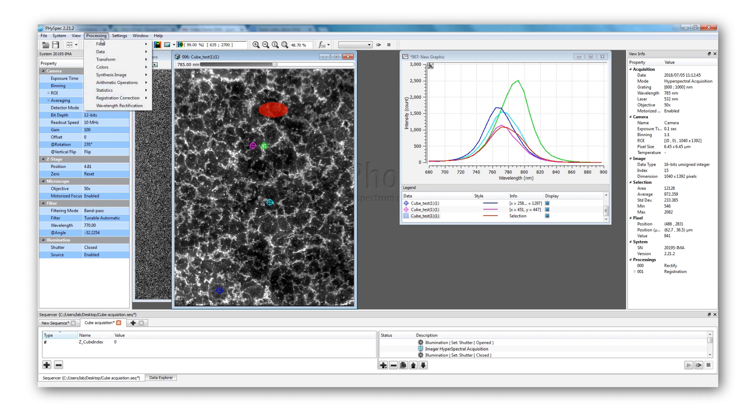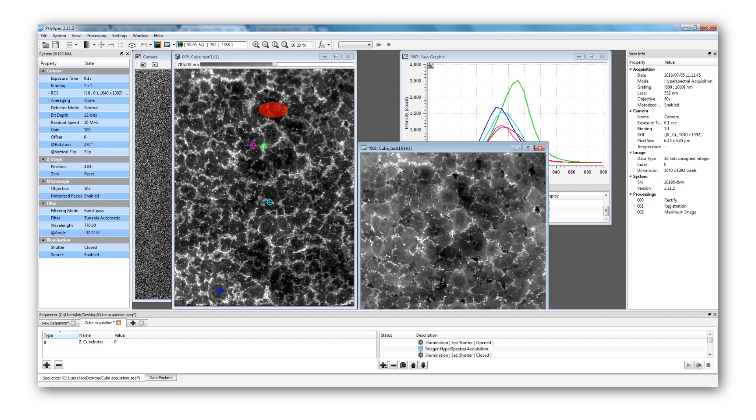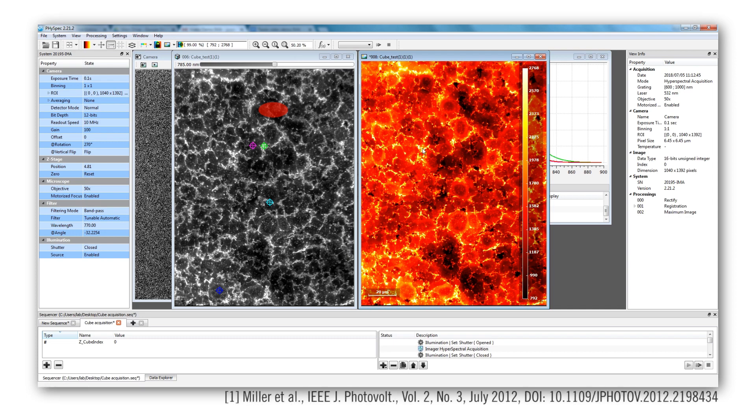Let's have a look at the different maps that can be made using FiSpec and the cube we just acquired, starting with the map of maximum intensity showing the highest intensity in arbitrary units that each region of the sample reached during the acquisition. The yellower a region, the higher its photoluminescence intensity. The false-colour images provide a rapid overview of the luminescence efficiency of a sample — a good solar cell is as luminescent as possible, and such a map provides information on non-radiative losses and indirectly on the efficiency of the cell.